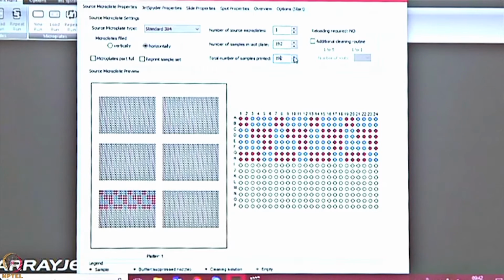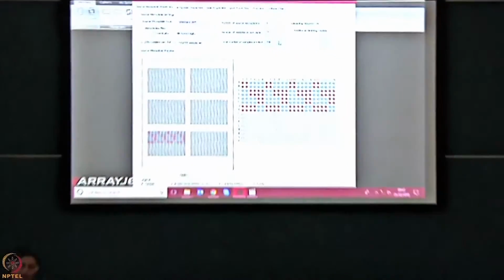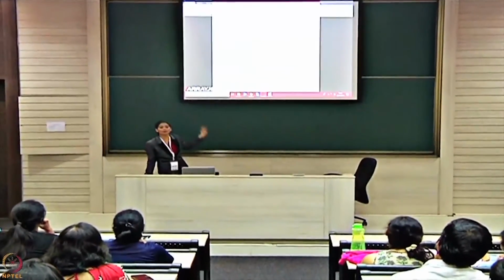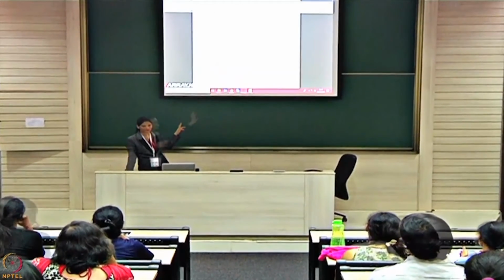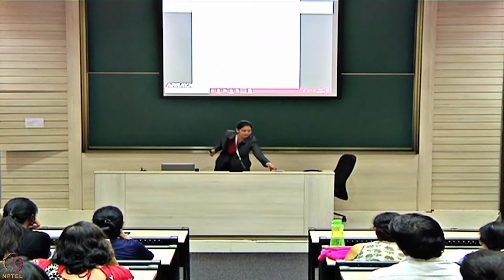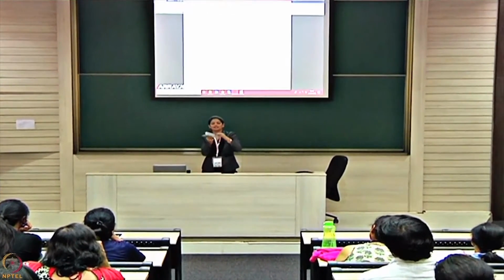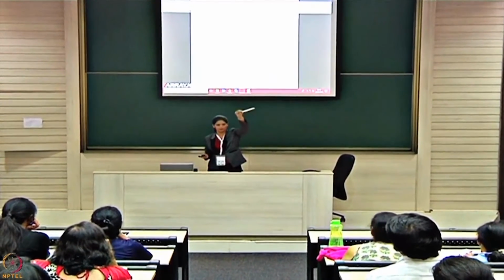So when we are doing assay transfers, we show you a full demonstration of how your assay manually can move horizontally, but this is only to prepare your source plate. This is not how it will look when you print it. This is your 384 well plate. So this is something like this plate. Let me show you. This one. So this is like any plate where you put 20 microliters of sample.